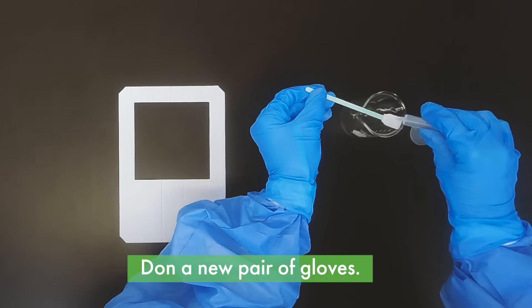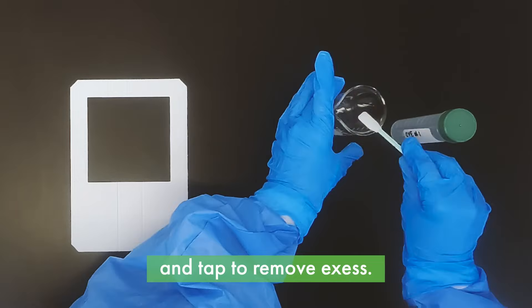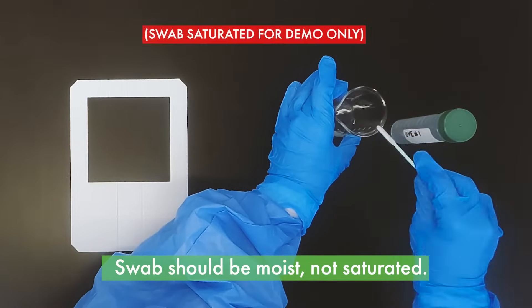Don a new pair of gloves. Wet the swab using the water provided and tap to remove excess. The swab should be moist, not saturated.